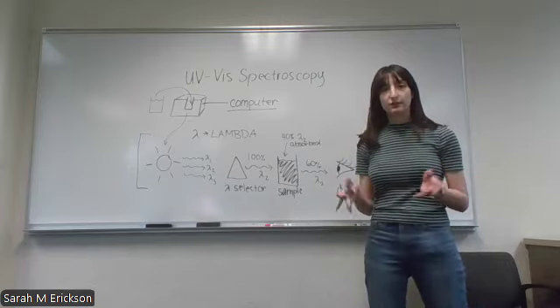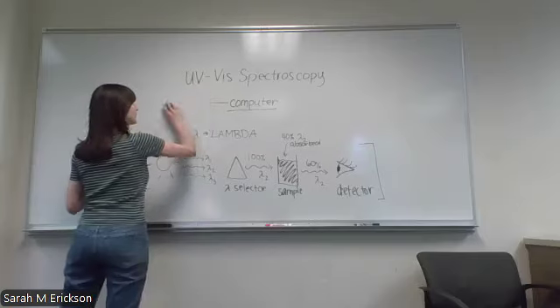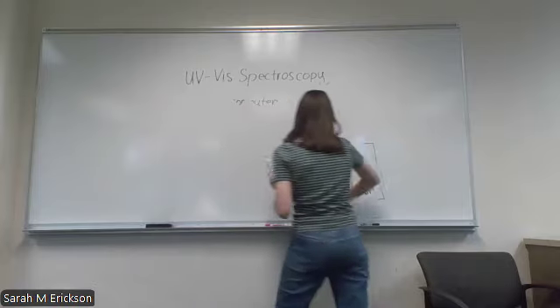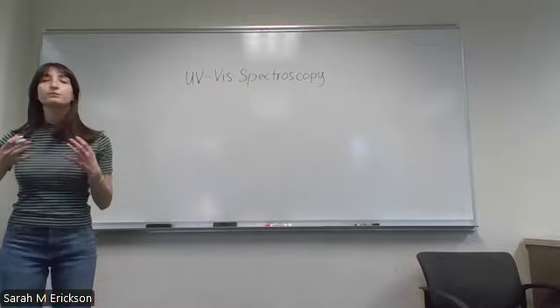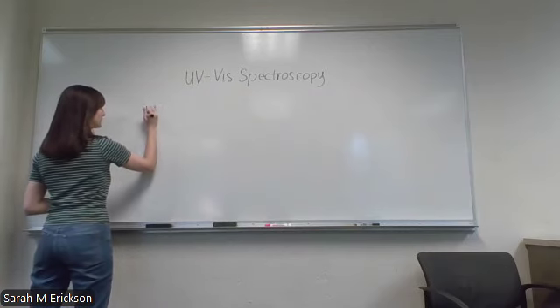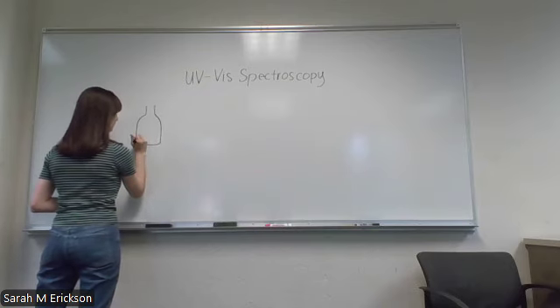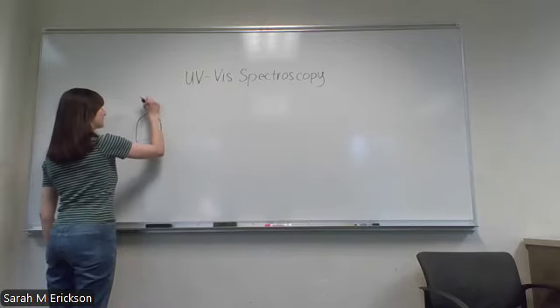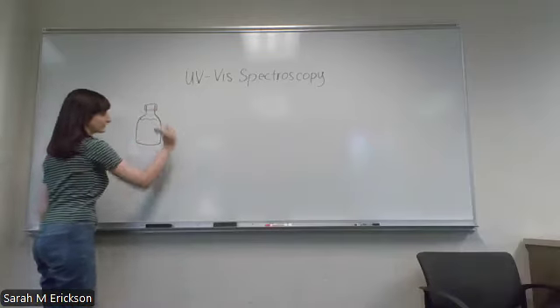So what the heck are we going to do with this information? Let me erase this, and then I will go ahead and break down this week's lab. So with this week's lab, you are going to have some kind of sports drink. You will need to bring in some kind of drink into lab. And this is probably the one and only time I will ever tell you to bring a drink into lab. So here's my pretty rough attempt at drawing a beverage. So you are going to bring some beverage in.